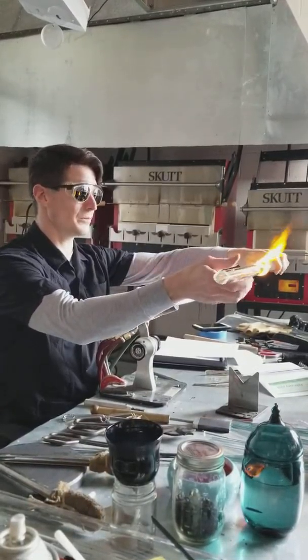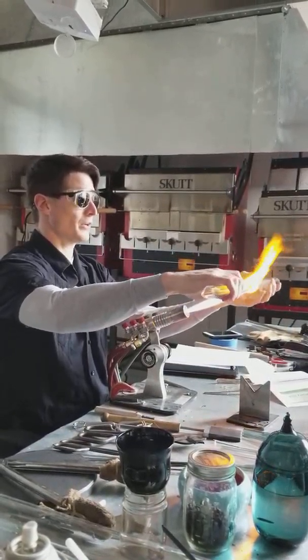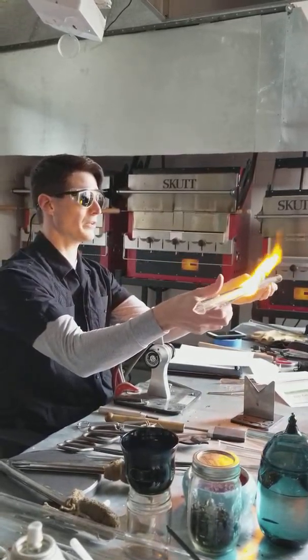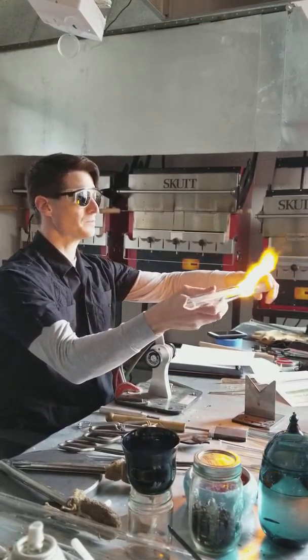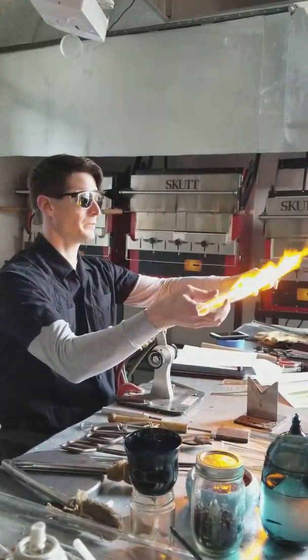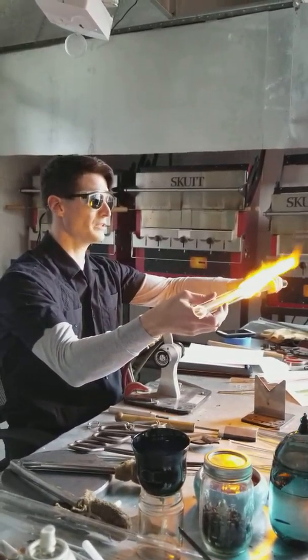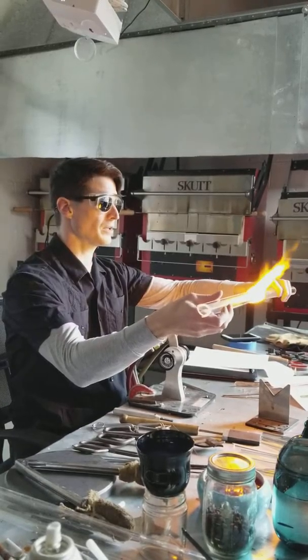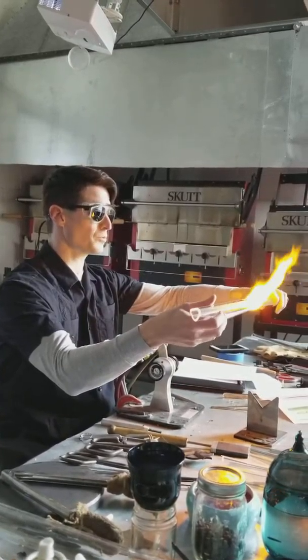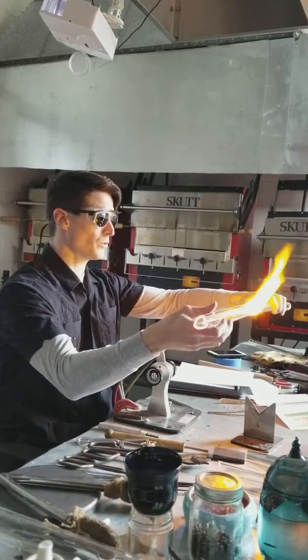We just want to go nice and slow. My hand position is over-under, but it can be over-under, over-over, or under-under — it should be able to be all of those things. I want to support the tube and what you need to remember is the onion. I want the heat to soak not just the outside — I want it to soak to the inside, so I start to see the tube look orange on the interior.